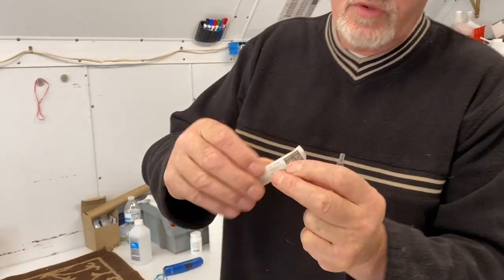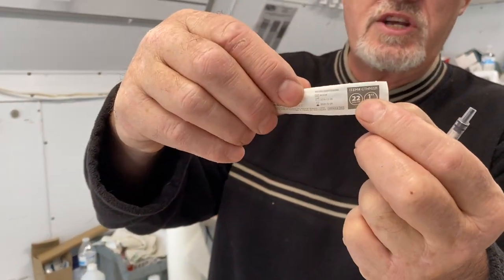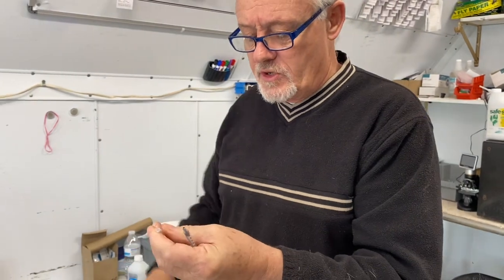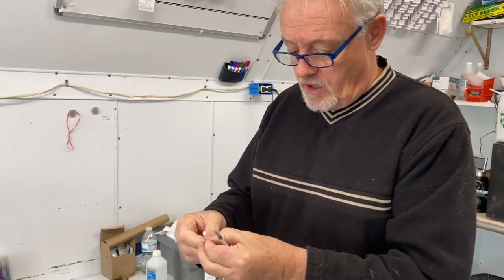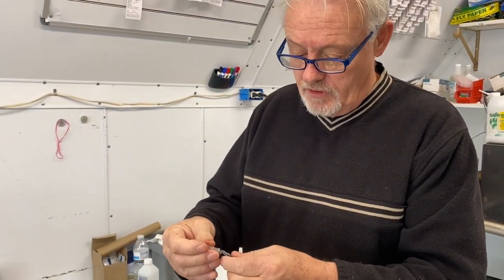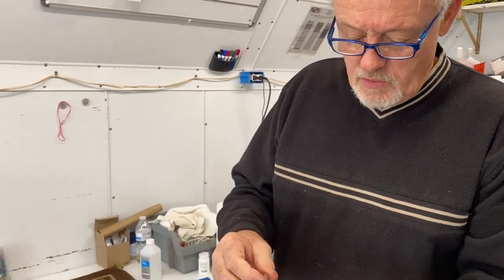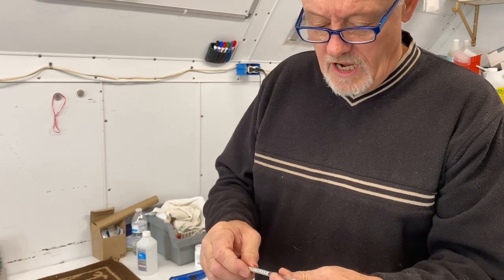We want to use a needle that's a 22 gauge, one inch needle — these work beautifully. If you try to use a 30 gauge, which sounds bigger but is actually smaller and is used for insulin shots, you will not pull blood out of that. So 22 gauge is preferred; 20, 21, or 23 gauge will also work, but I like a 22 gauge.